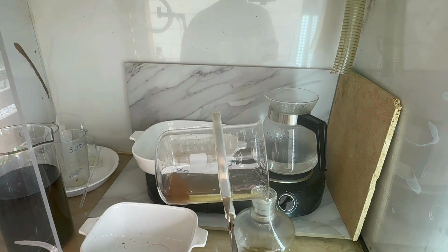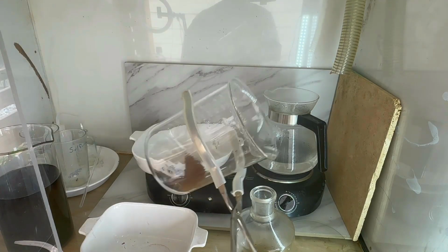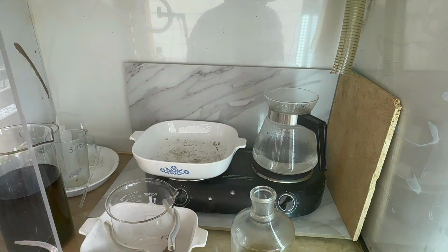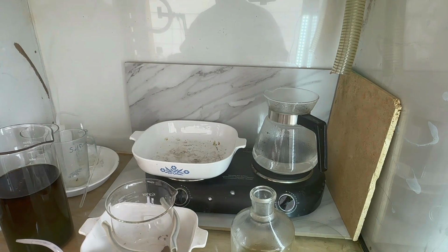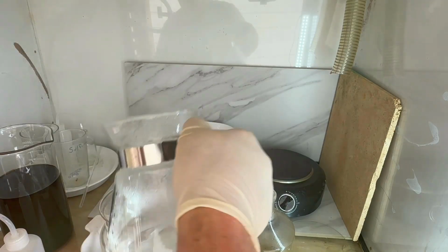Any gold that's potentially gone in solution or any of the little bit of powder that comes over in the rinses comes right in here to settle, and at some point down the road we'll do this whole thing again and recover that as well. See a nice little bit of gold in there, probably more than I anticipated. As we go through this, I'm not unhappy about that. The good thing is, unless you throw it away, you never lose it.